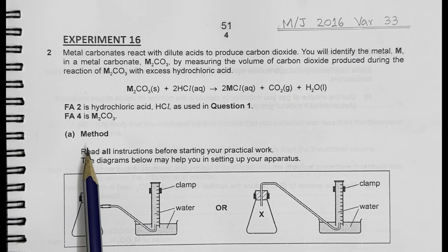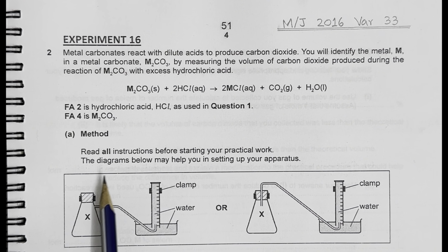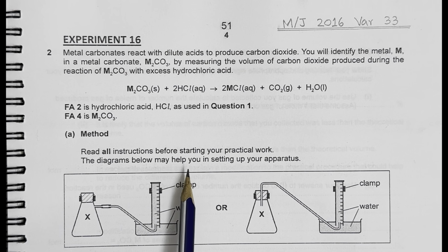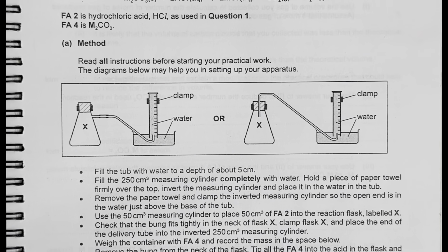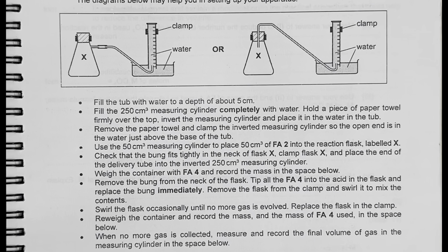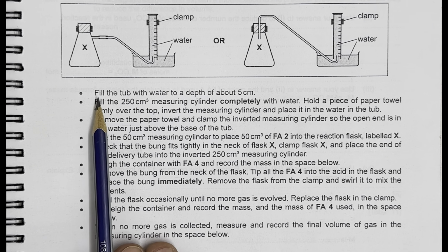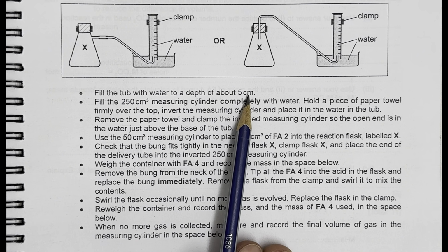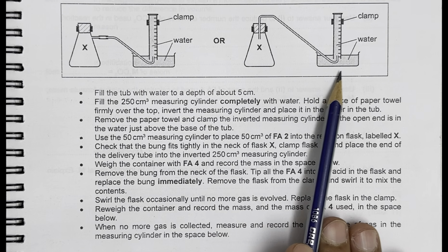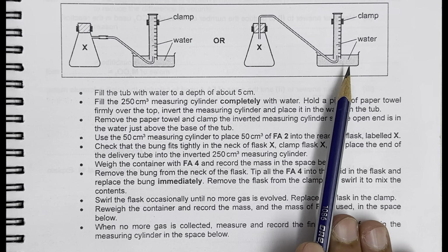Method. Read all instructions before starting your practical work. The diagrams below may help you in setting up your apparatus. So now here they have given us a diagram also, and if we look at the method, they have given us a long method explaining what they have done. Fill the tub with water to a depth of about 5 centimeter, which can be seen here that this is the water tub filled with water up to 5 centimeter depth.